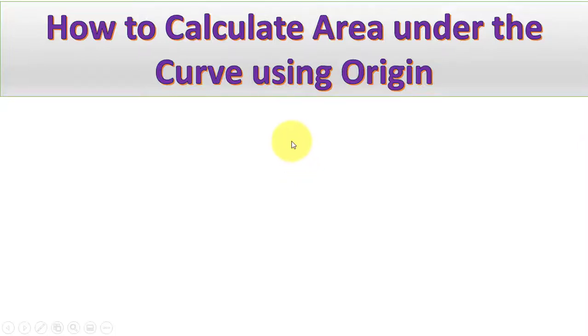In this video, we will discuss how to calculate area under the curve using Origin.